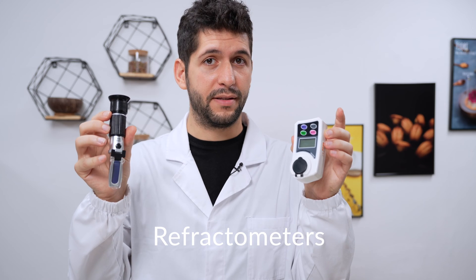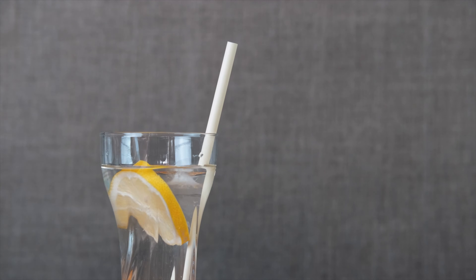These are both refractometers — this is an analog, traditional one, and this is a digital one. They can both be used to measure sugars. Refractometers measure the refractive index of a liquid, which is basically how much light is deviated passing through the liquid. From physics experiments, we know the refractive index depends on what is dissolved in water, so we can relate it to a specific substance — the more of that substance present, the more the refractive index changes.